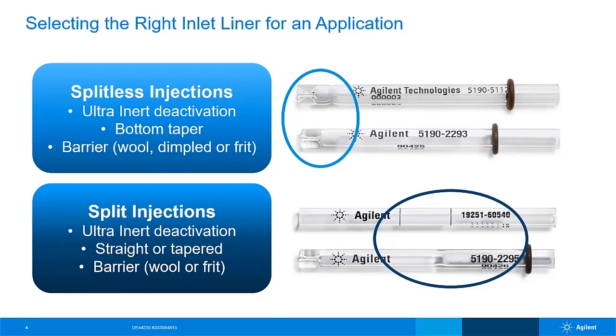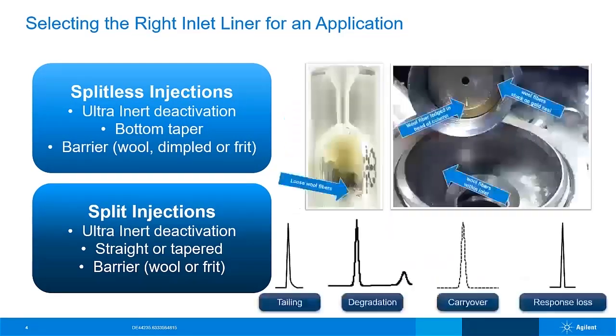Now remember, do not do split injections on a splitless liner. There's not enough room for the split flow, and the analysis will suffer from poor reproducibility.